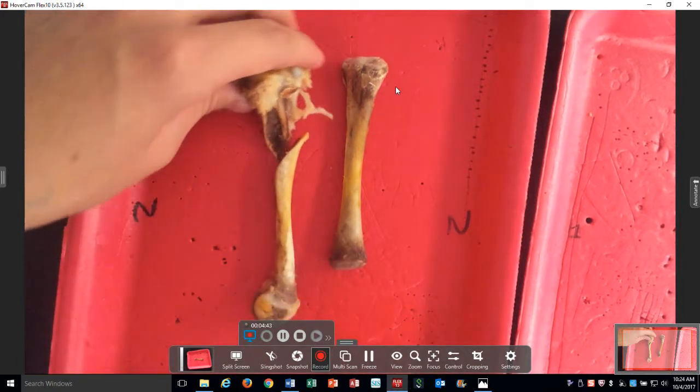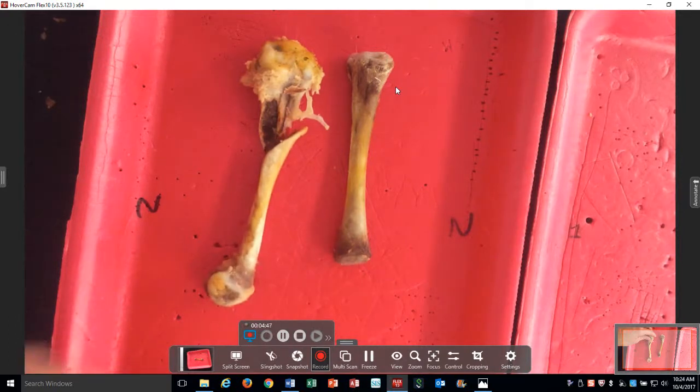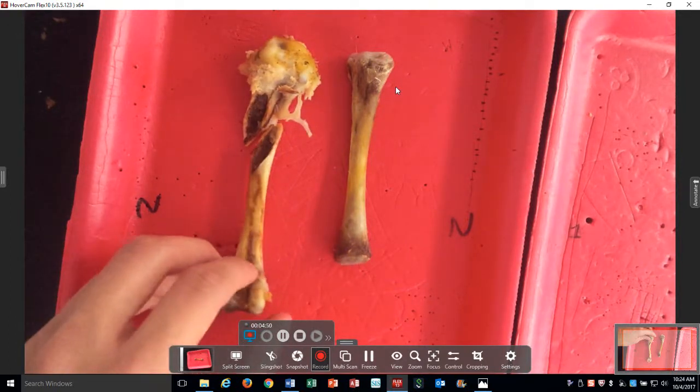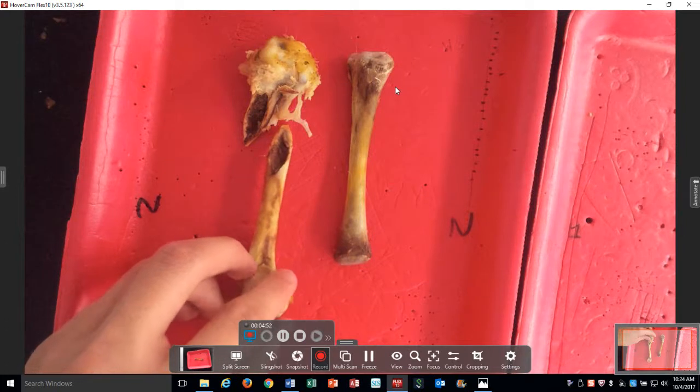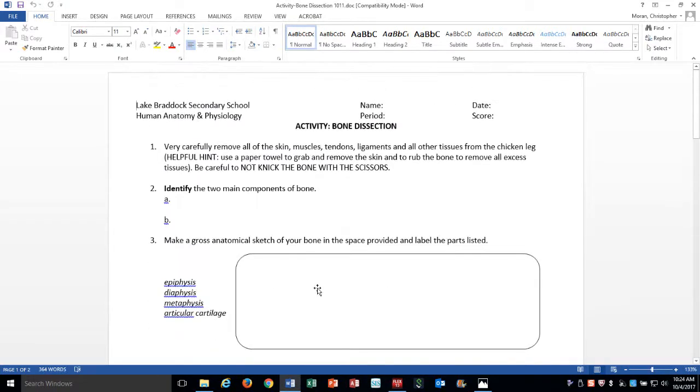We won't be able to say what's red or yellow yet, but yellow marrow has adipose tissue and red marrow is where you make red blood cells. So this is day one — all we have to do now is mass it and then wait for me to soak it overnight. That's part one of our bone dissection.